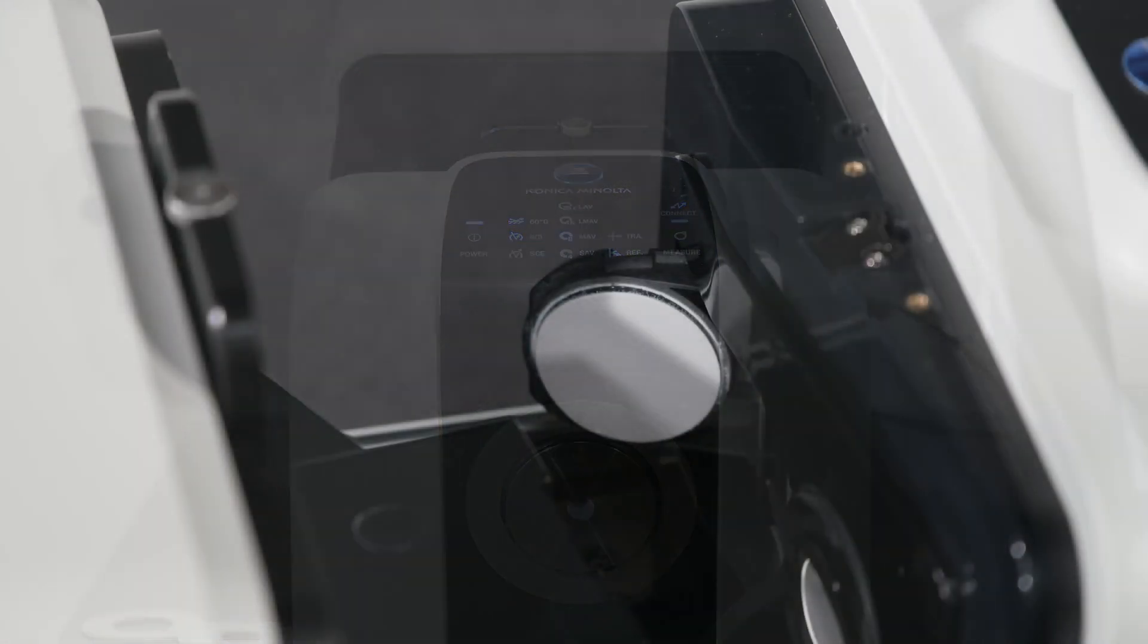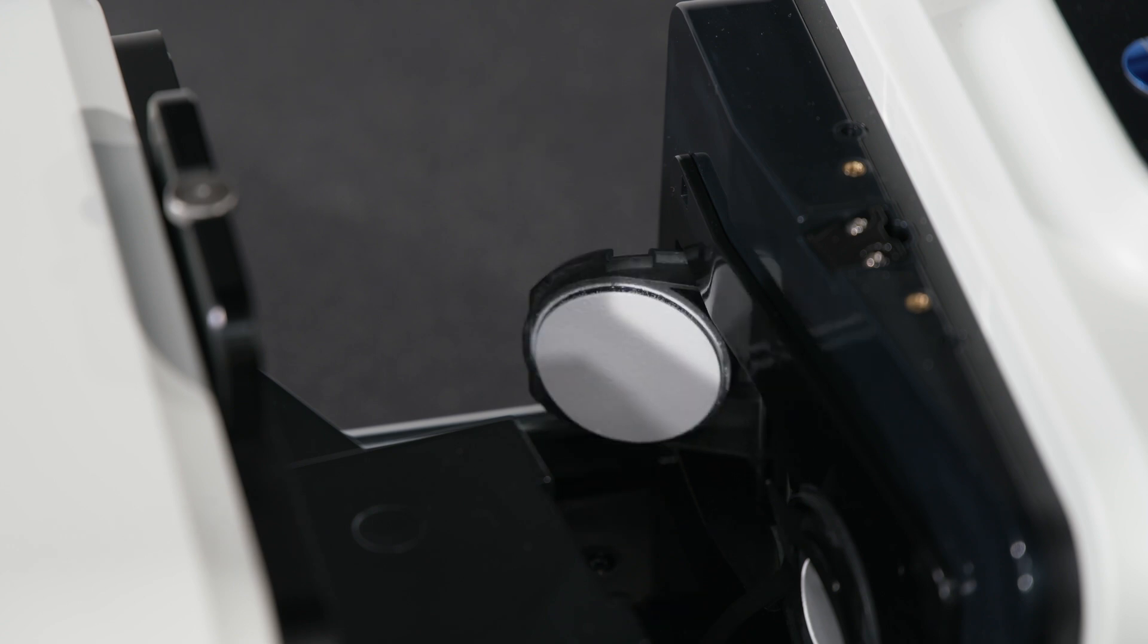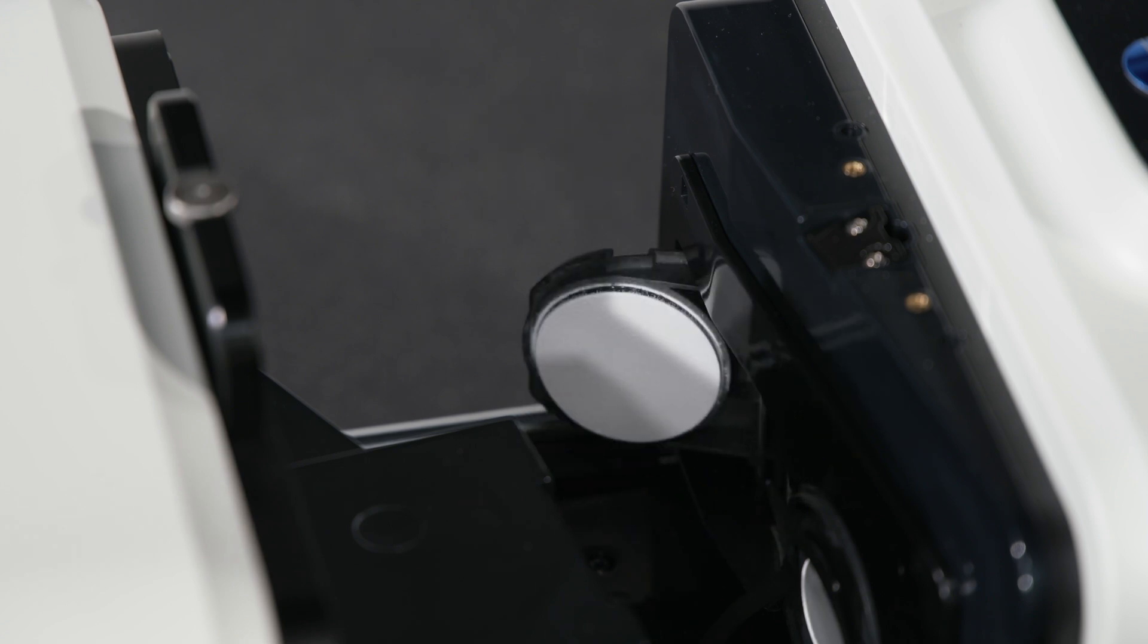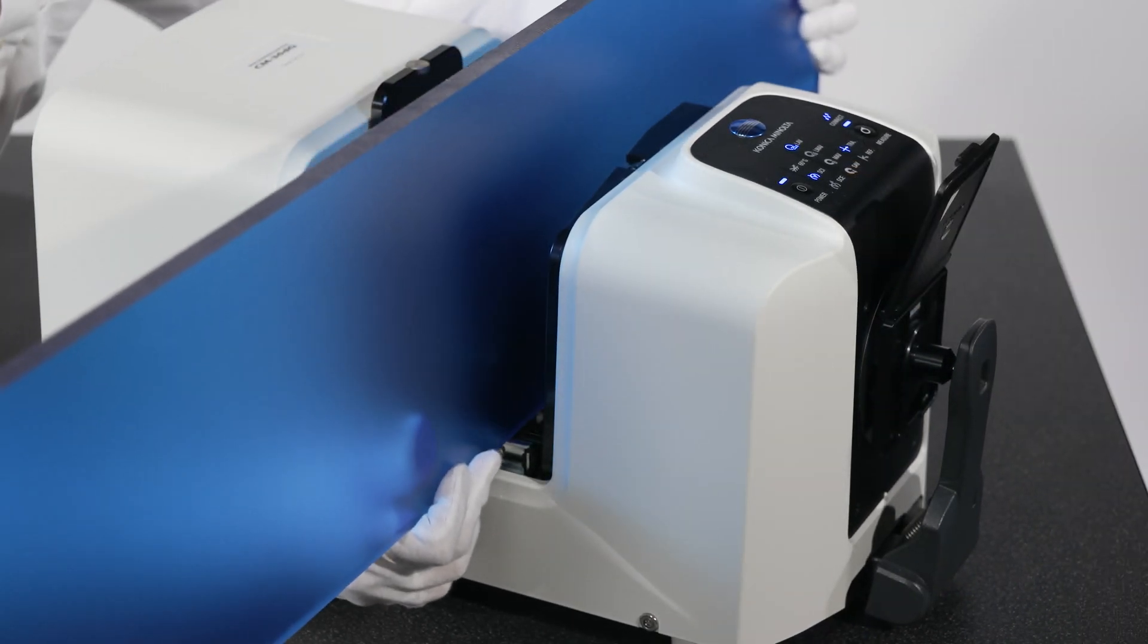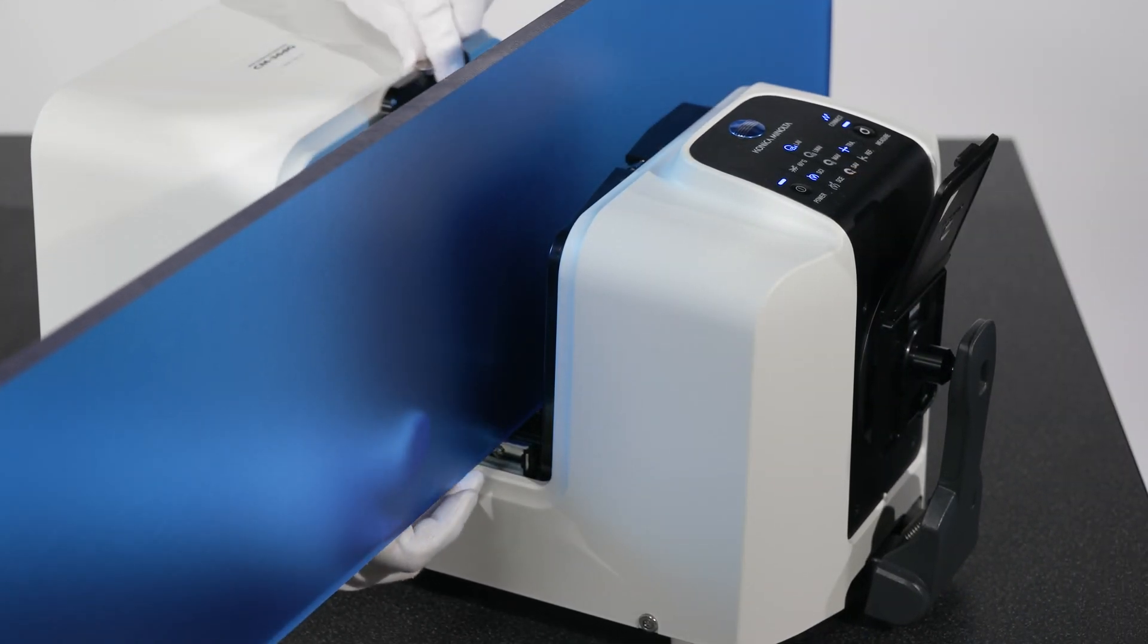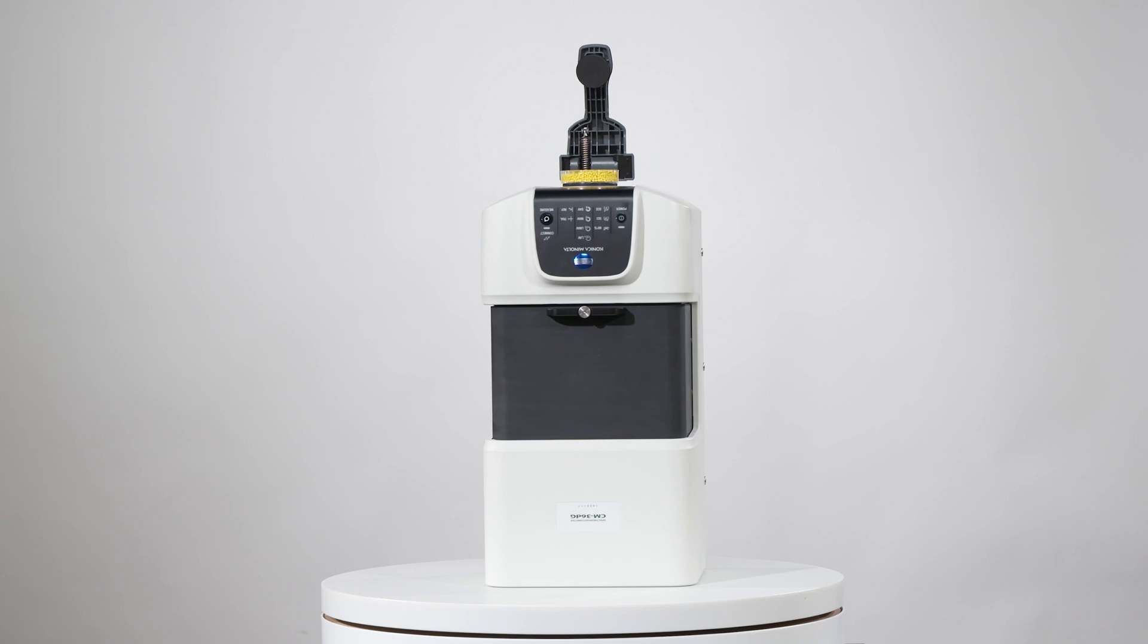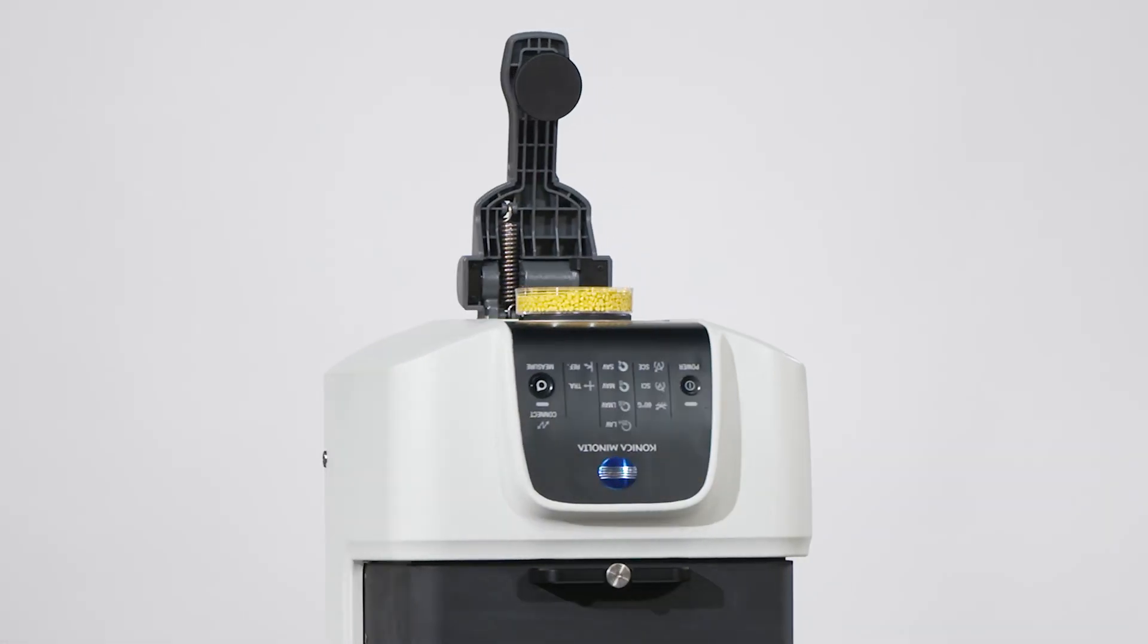The CM36DG offers a port that opens and closes to provide either SCI or SCE measurements, a wide transmission chamber for easier sample placement or measurement of larger samples, and vertical positioning to measure samples in a Petri dish as shown.